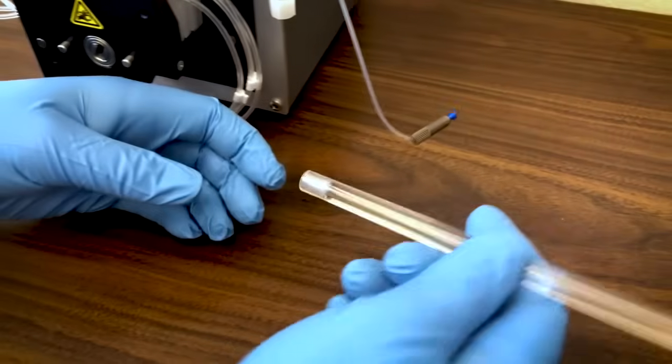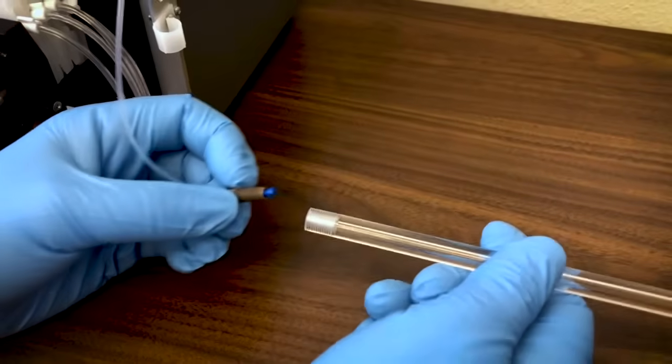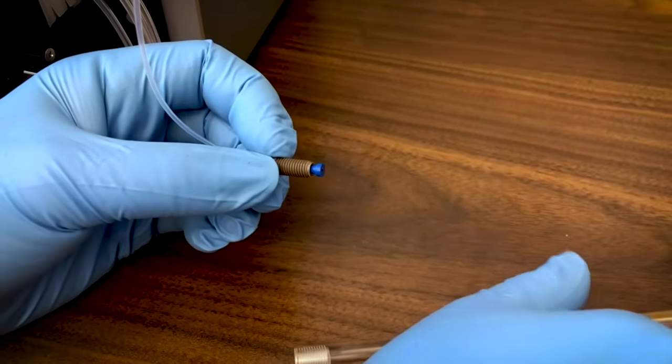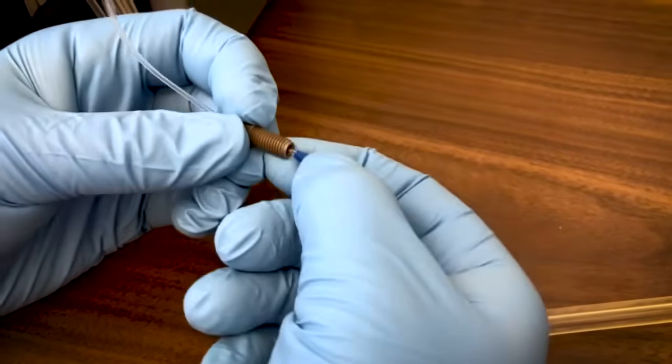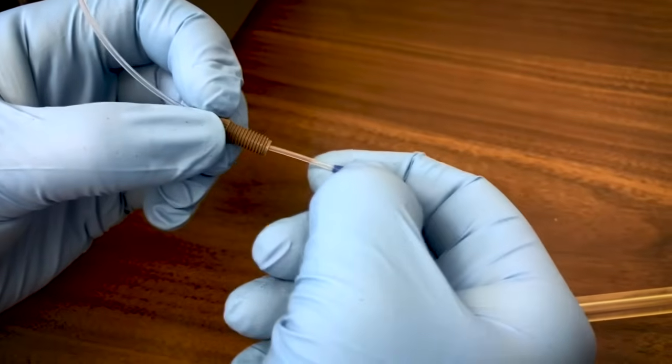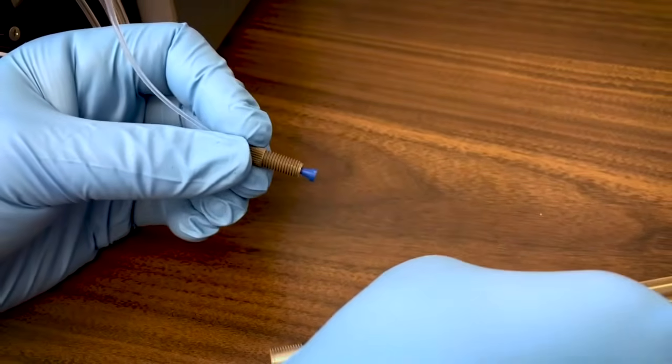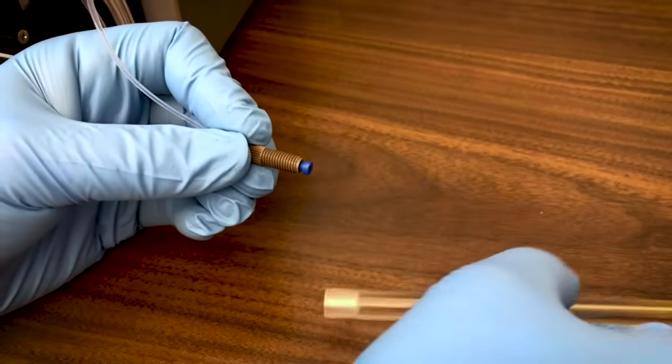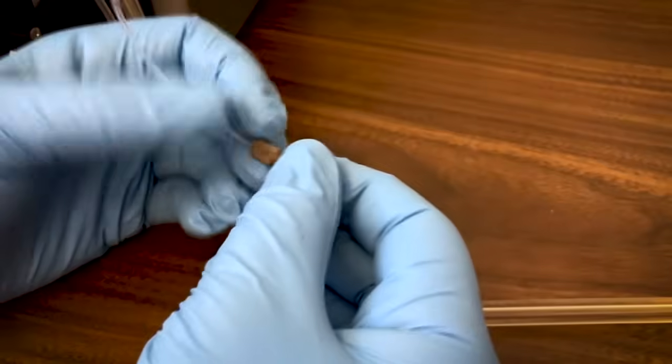Screw the tubing onto the bottom of the column first. It's bi-directional, so use whichever end you removed the cap from. If the ferrule is stuck, you can use your finger or the inside of the threaded port to break the ferrule away from the nut so it will turn freely, and then simply screw it back into the column.